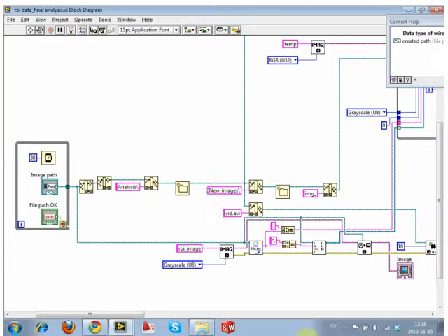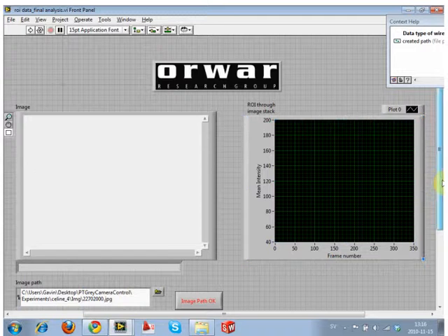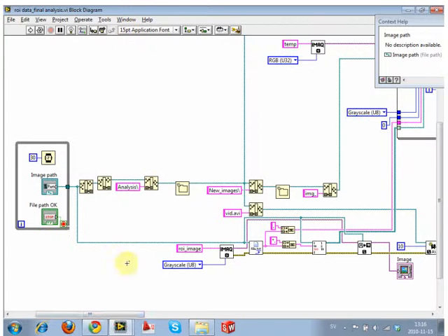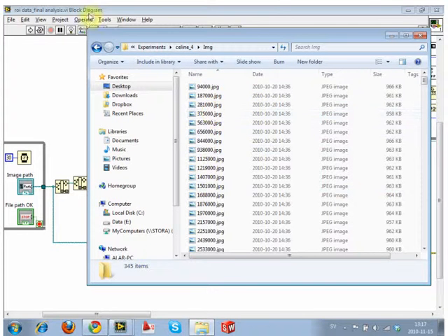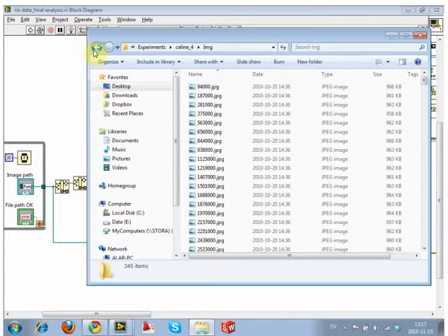And equally, we don't want to have, on the front panel, like 15 different image input boxes, because it's not necessary. By stating this one, all of the file structure can be established from this location. So you put every time in the same folder, close to your origin image. Exactly. So we essentially would be clicking on one of these files, and it just puts it in the parent directory. We make a new folder in the same parent directory, so that they're always together. But we're not writing anything to the folder which has your images in it, to keep it clean.